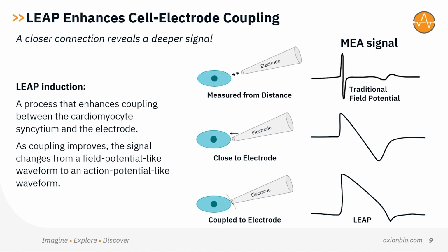So LEAP is not changing the fundamental biology of the cells. It is merely changing the recording relationship between the cells and the electrode, allowing the electrode to capture a deeper signal.